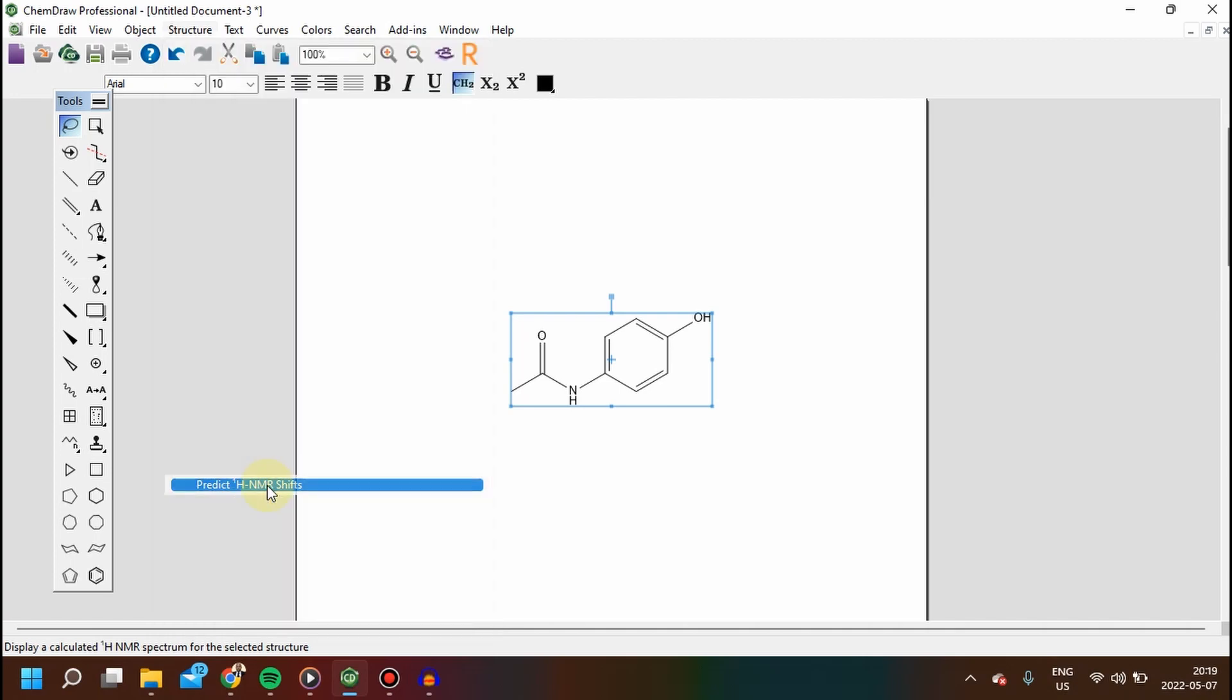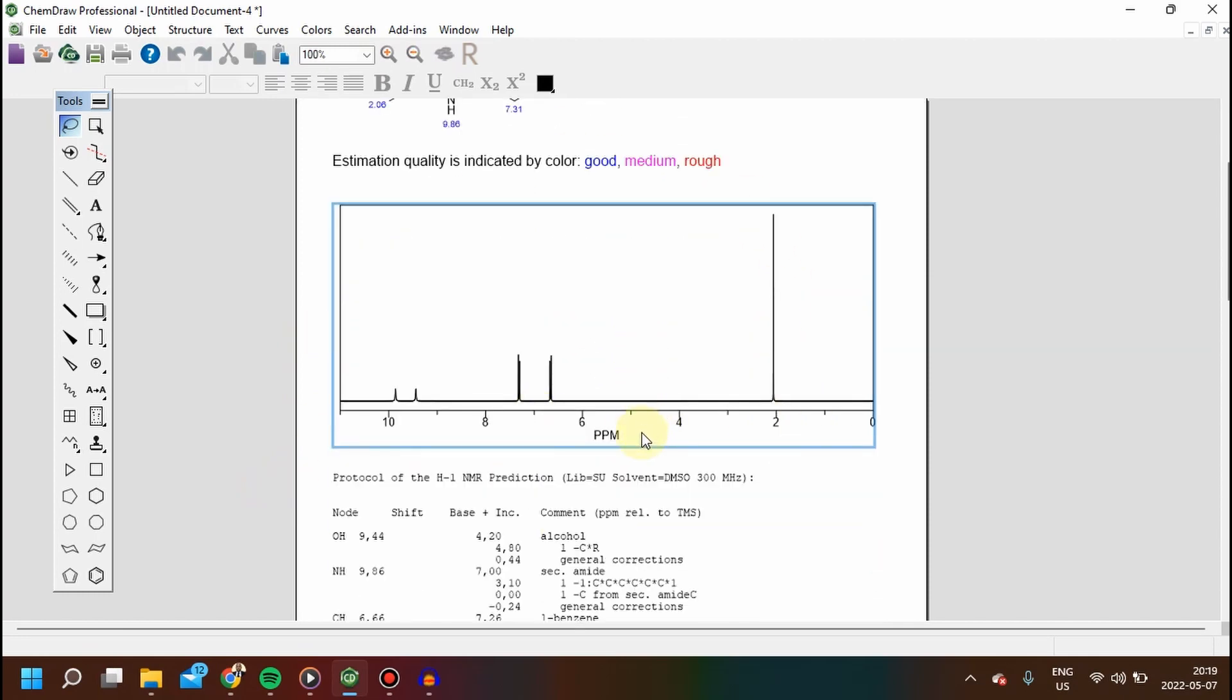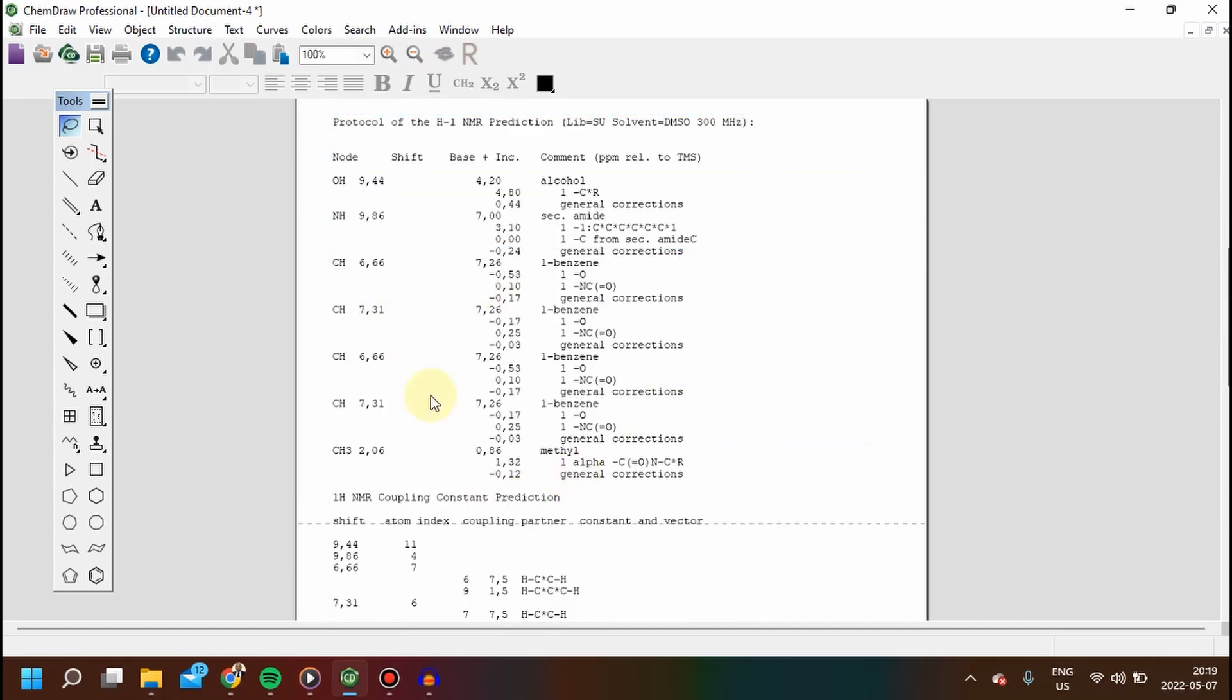When we click there, we have this window that shows the spectrum and also the numerical data for the proton NMR shift for each proton.